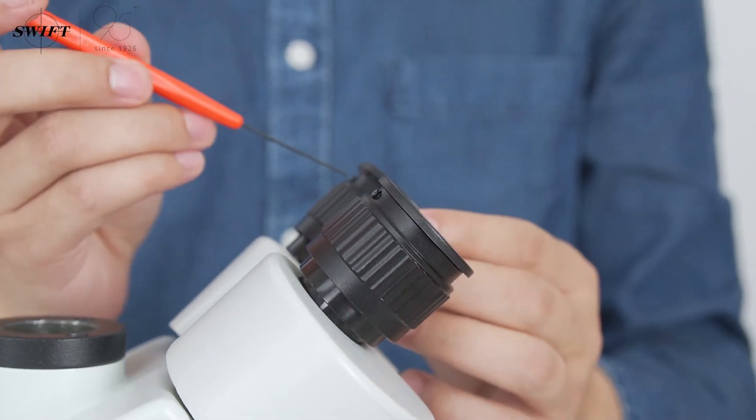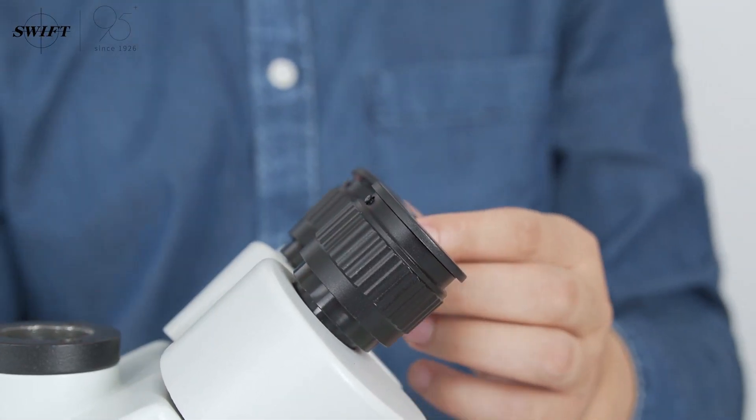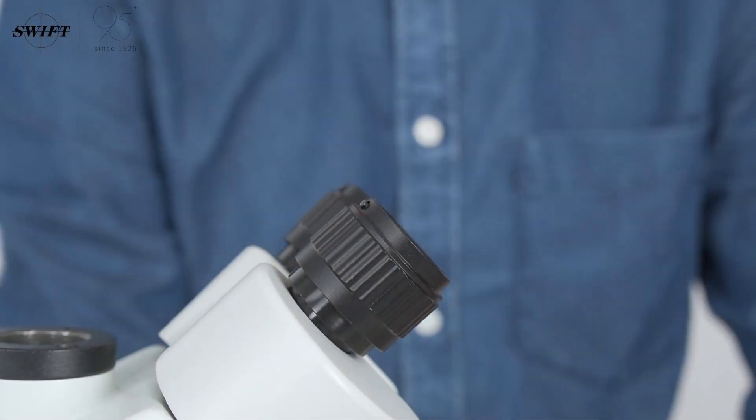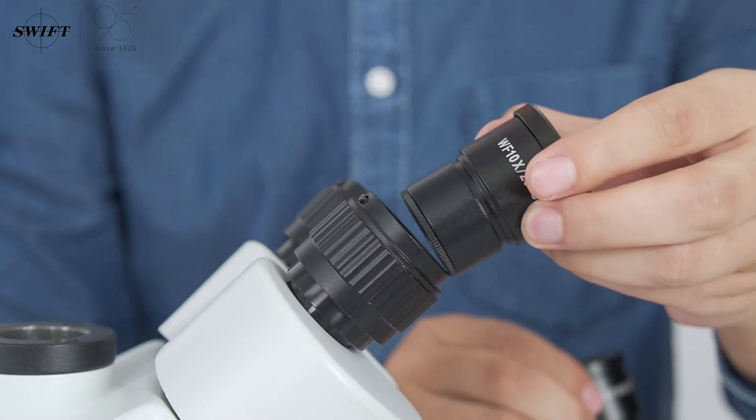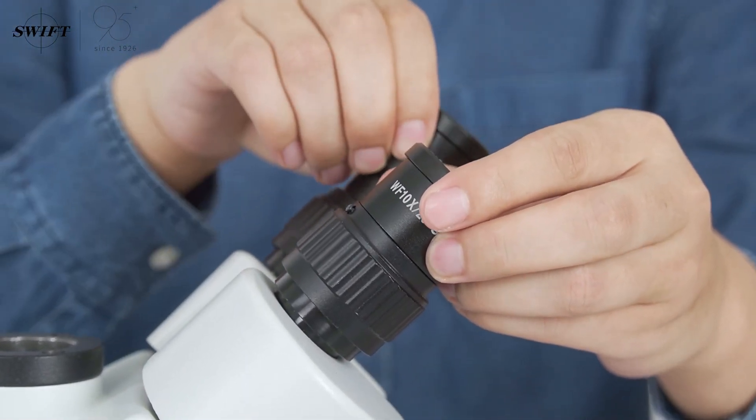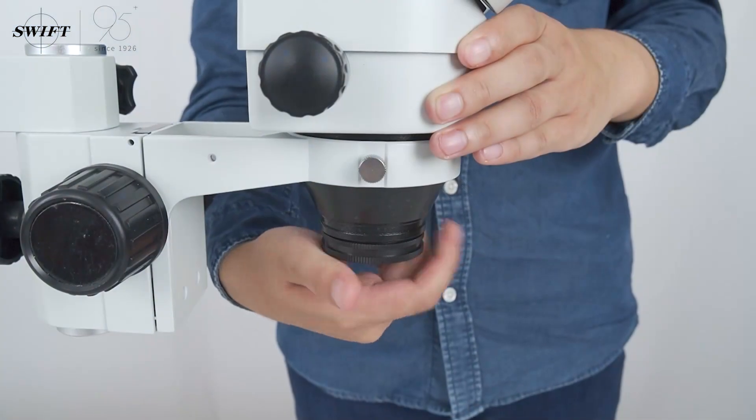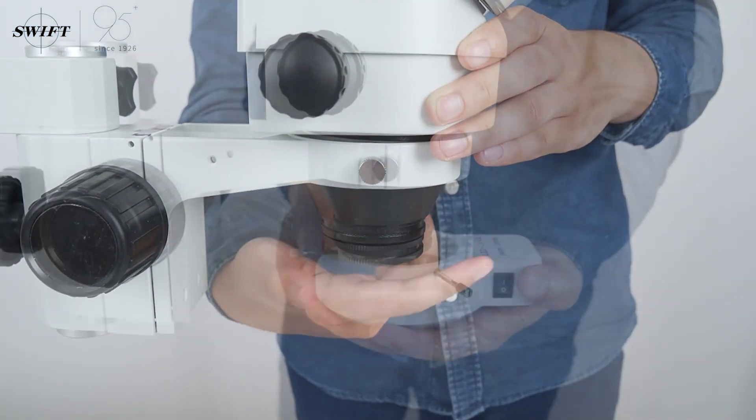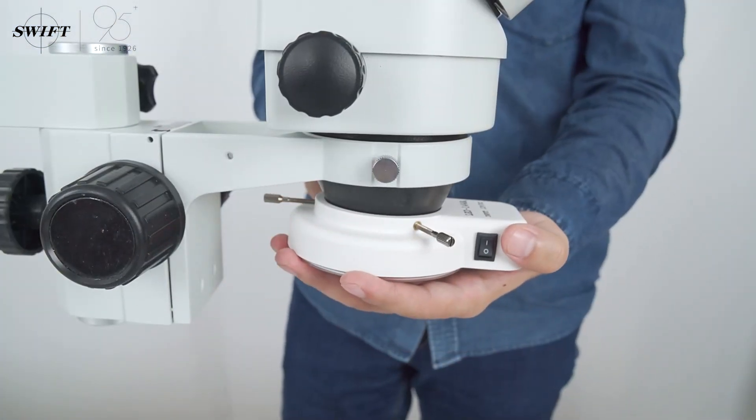Loosen the screws on the protective cover of the eyepiece tube and put in two eyepieces with the same magnification. Unscrew the dust cover and install the required LED AP light source.